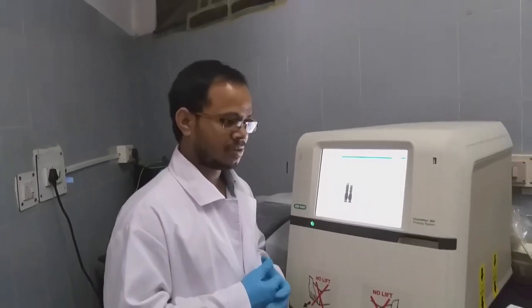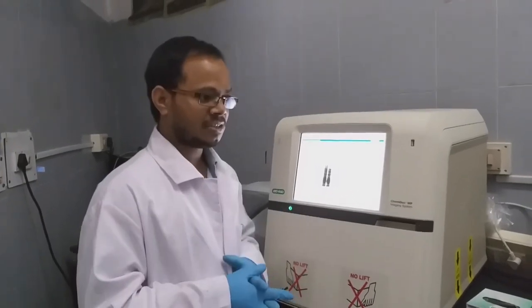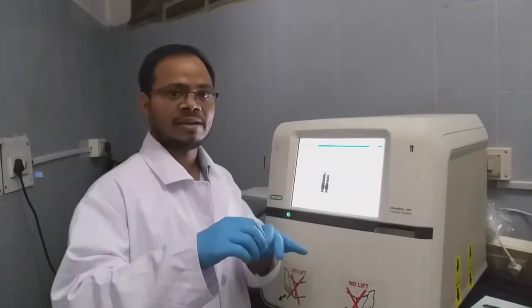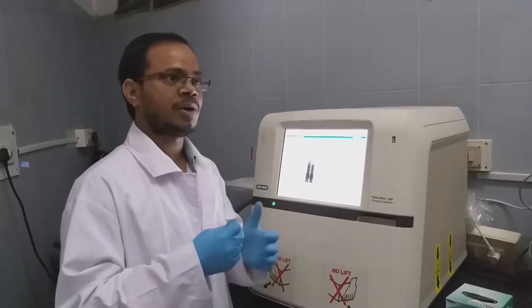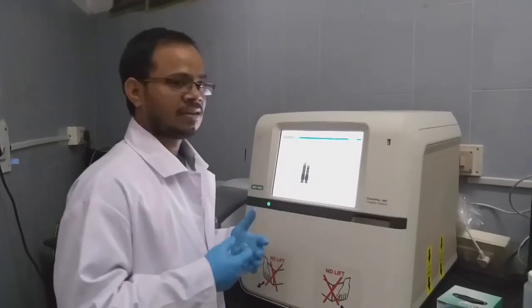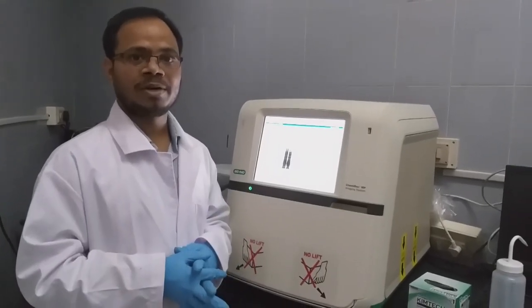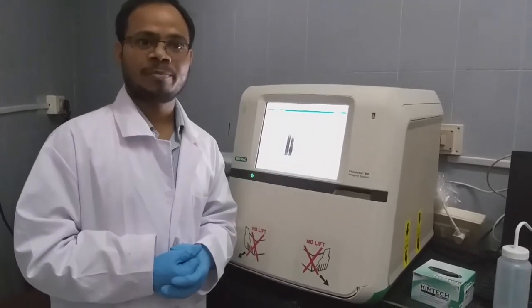These are all other bands we are seeing in the eluted fractions, and those are because of contaminants or degraded protein. Contaminants sometimes may come because of 2, 3 or 4 histidines in the folded state, which gives the possibility to bind to the nickel NTA column. Also, vigorous washing should be done. If you don't wash properly with a high amount of imidazole, that will give you this kind of non-specific binding.